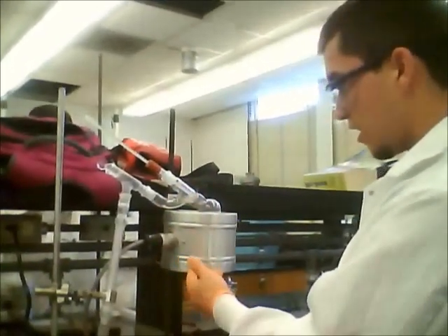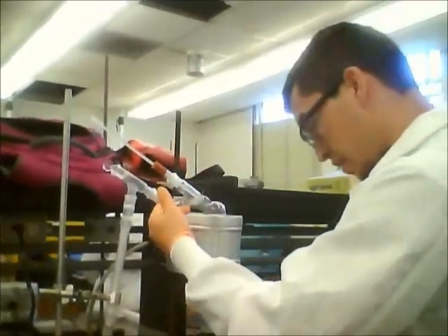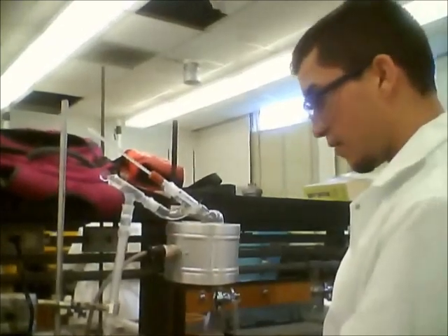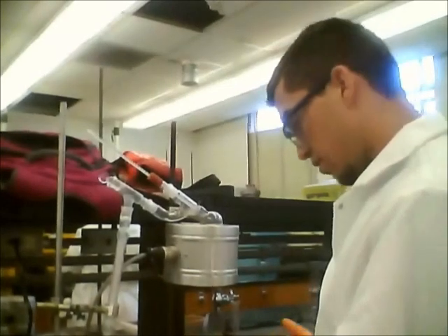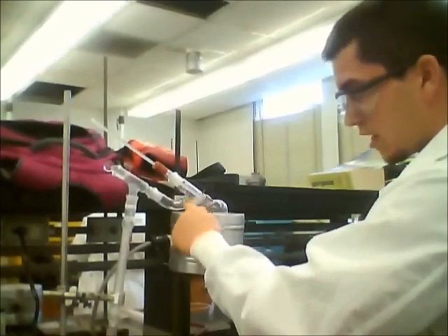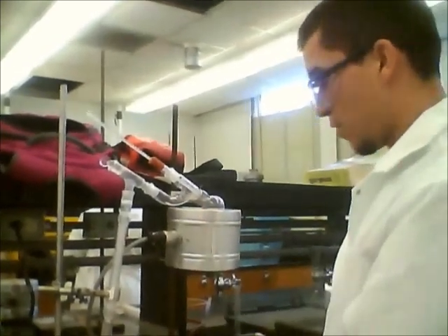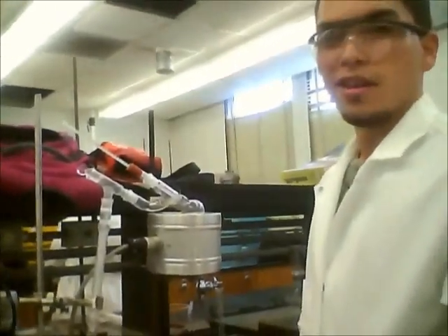We've got the heater right here, we've got the pot, we've got the Kleisen adapter with the thermometer, and then we have the condenser which is basically just a safety feature. Right here on this portion is where we want to measure the temperature and where the distillation is actually going to occur. That's the setup without the milliliter of cyclohexane.